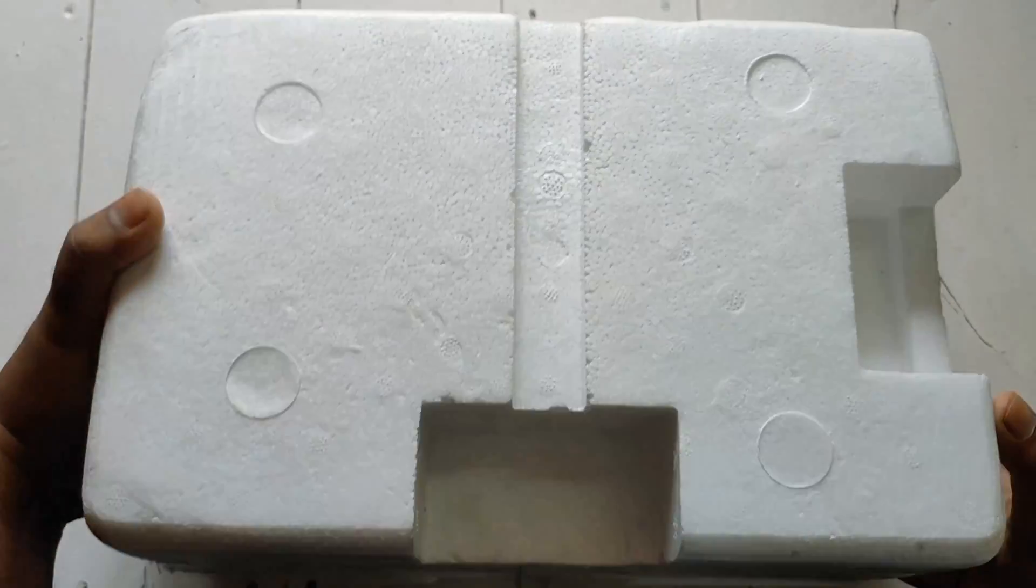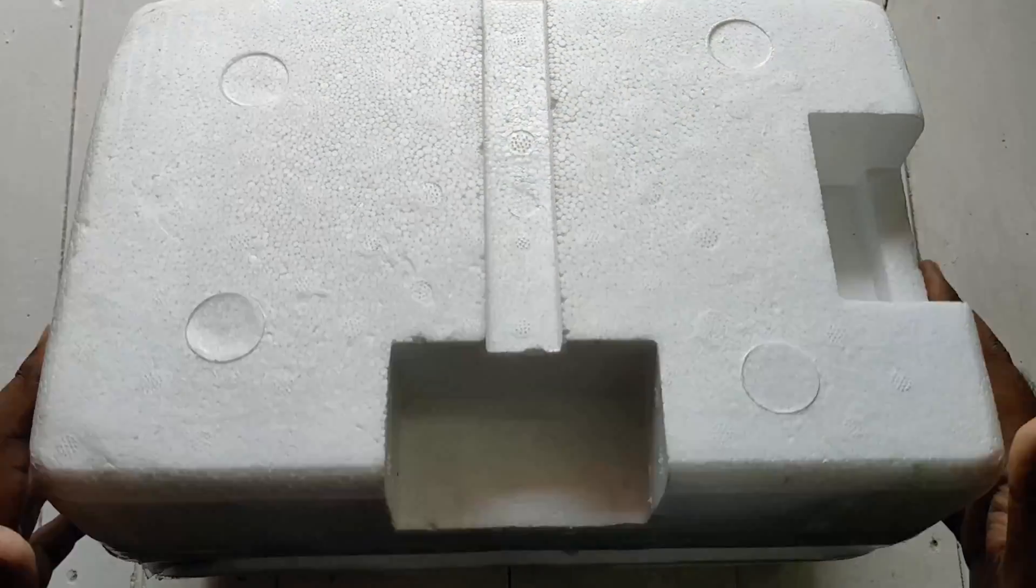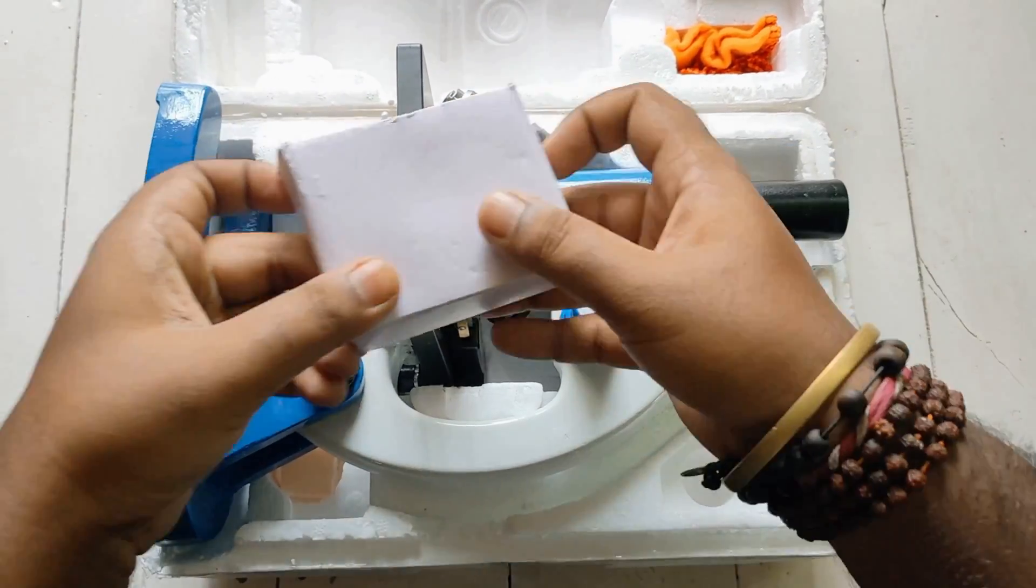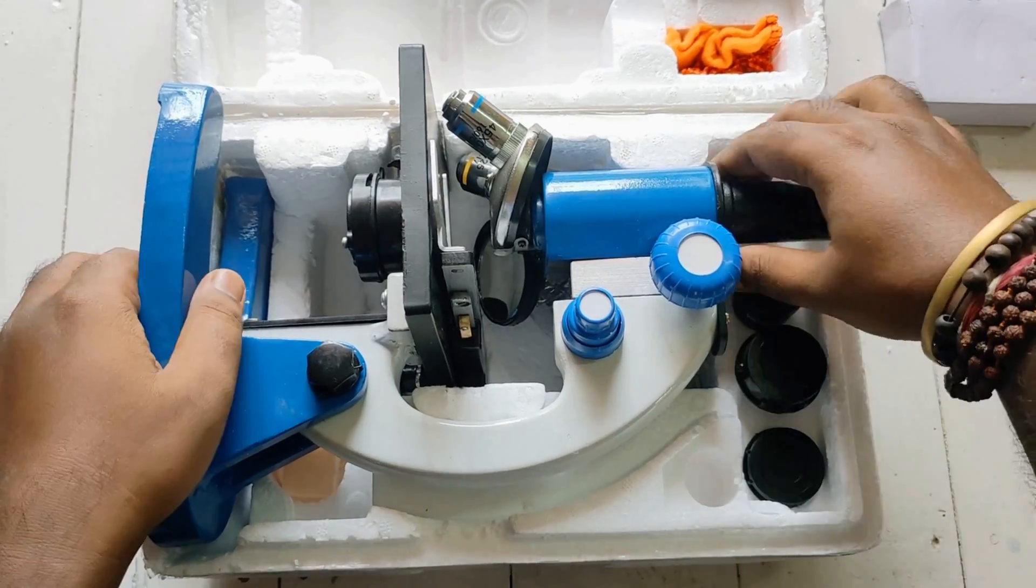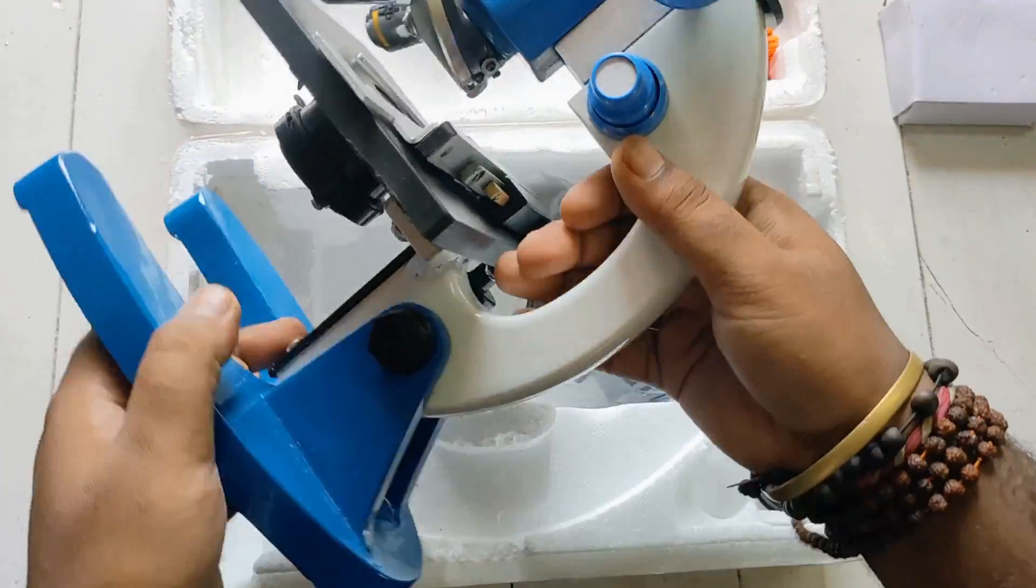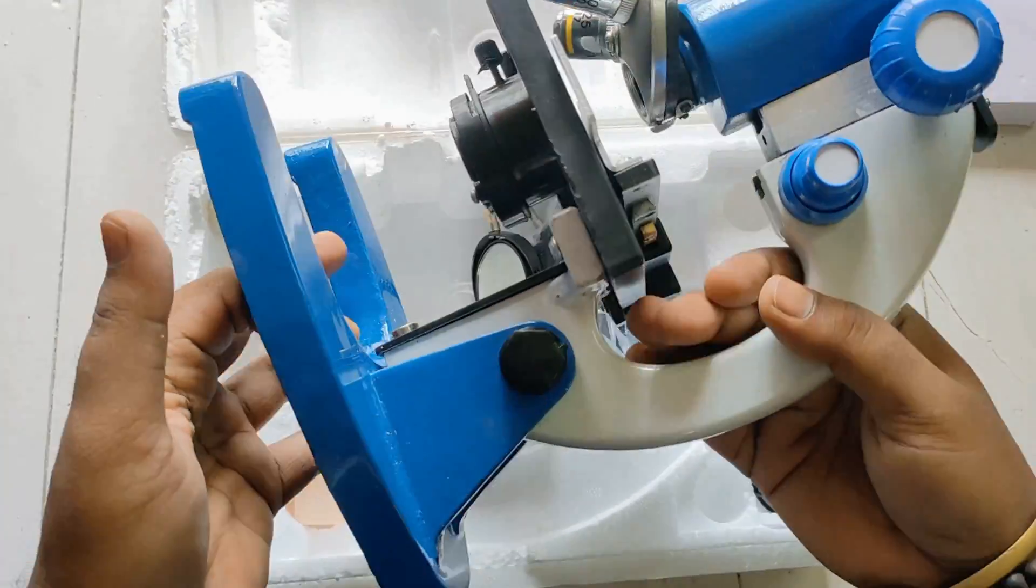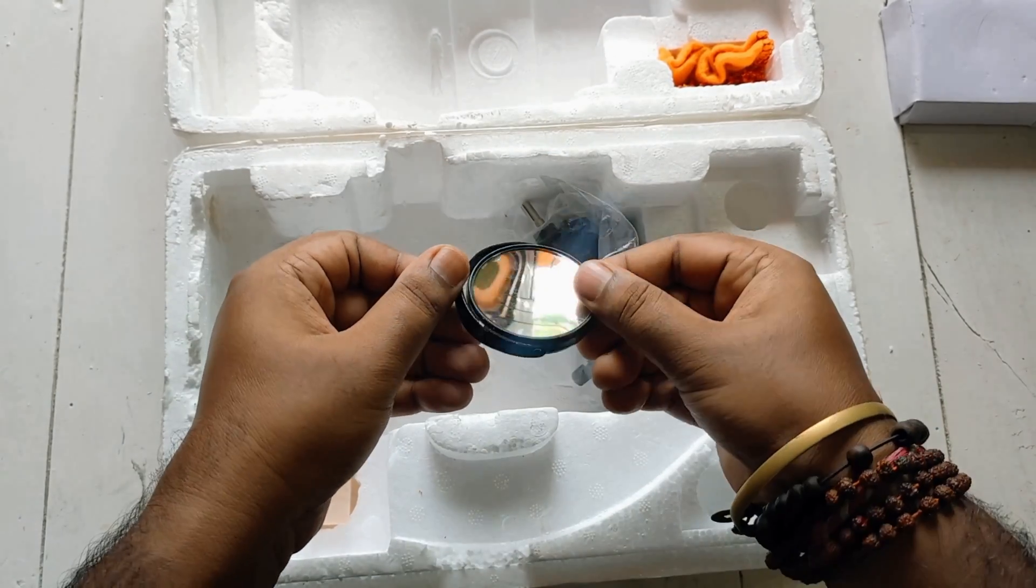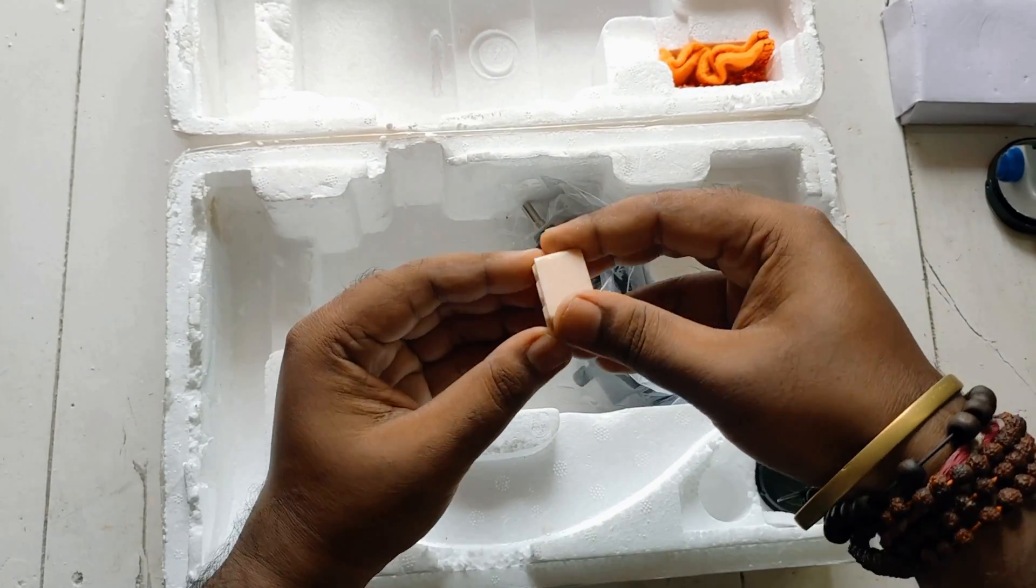So now let me open this. Wow, great! Look at this microscope - looks beautiful with its unique color. Let me take out these things. Oh, it's really heavy, full of metal and feels so strong. Double-sided mirror, flat and concave. This little box full of coverslips.